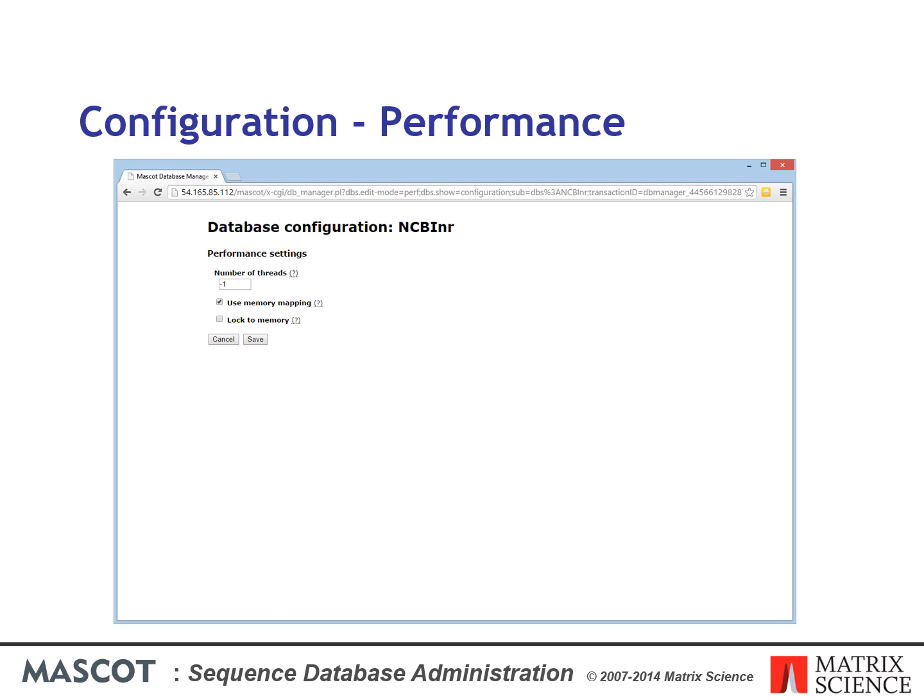Each CPU in the Mascot license allows use of up to 4 cores, which requires 8 threads for a hyper-threaded processor or 4 otherwise. On a cluster system, the number of threads is set for each search node in a separate configuration file, nodelist.txt.